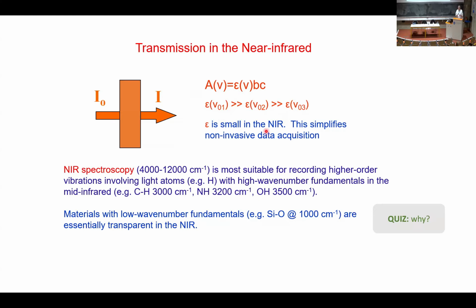So that allows us to do non-invasive data acquisition, collect spectra on the sample as is.